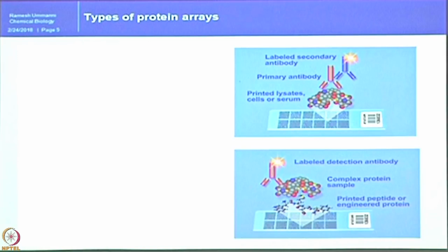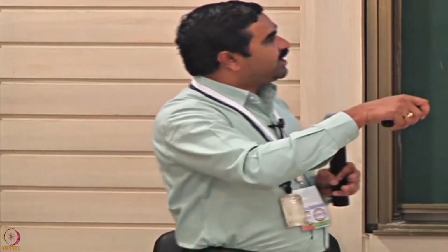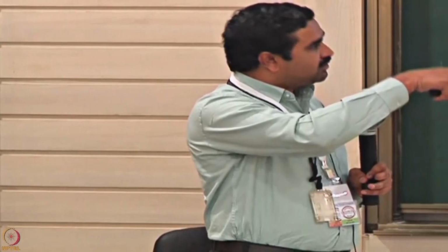The difference is here. You can also use this approach for epitope mapping. You can make fragments of the protein, and those peptides can be printed separately, and you can map which domain of the complete protein is binding to the binding partner. Say it is 100 amino acids, you chop it into 4 different parts, 25, 25, 25, 25. The interacting partner, the prey protein, may bind to the peptide between 51 to 75. So, how can we map that?